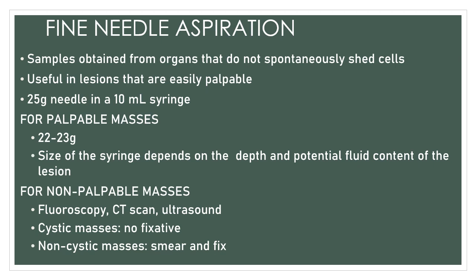Now let's take a look at palpable masses. These use a gauge of 22 to 23, the same as the needle gauge used in venipuncture or phlebotomy.